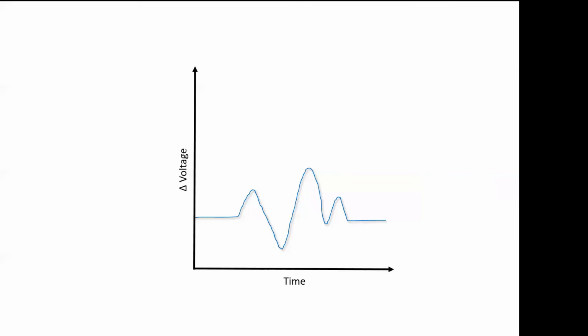Okay, so when we measure physiologic data, we're going to get graphs like this. What you're always going to see on the x-axis, you'll see time, because we're trying to measure changes in something about the body over time. And then our y-axis, if we're looking at the raw data, the raw output, directly what's coming out of our device that's measuring something, our measurement here is actually just going to be voltage, because we've turned our physiologic data, our events in the body, into an electrical signal.